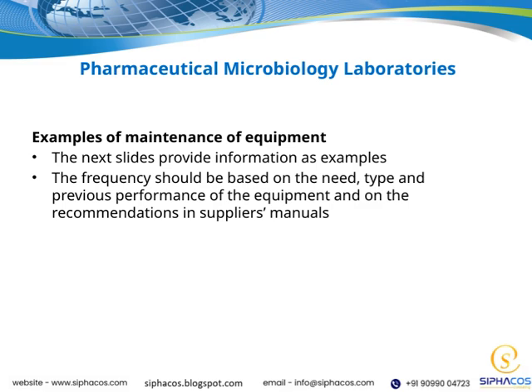In pharmaceutical microbiology laboratories, maintaining equipment properly is crucial to ensure reliable results and a sterile environment. By tailoring maintenance schedules to the equipment's performance and following supplier guidelines, we can prevent issues before they arise and keep our laboratory running smoothly.